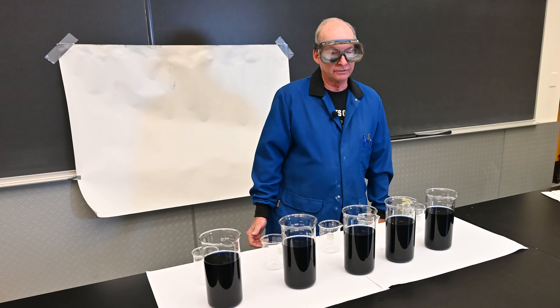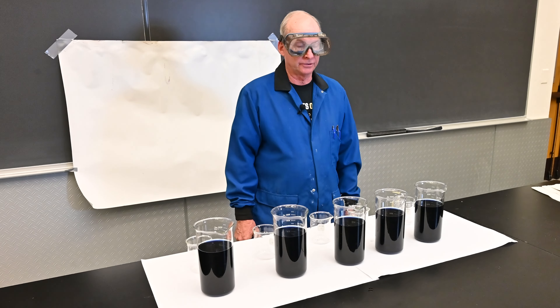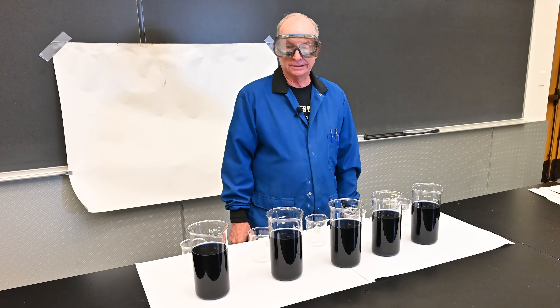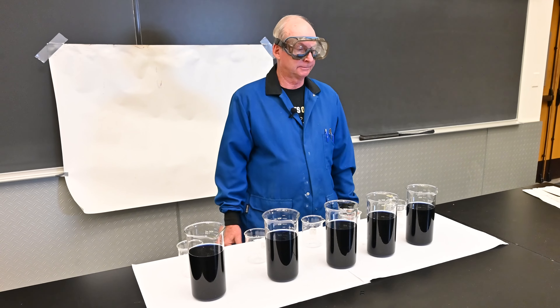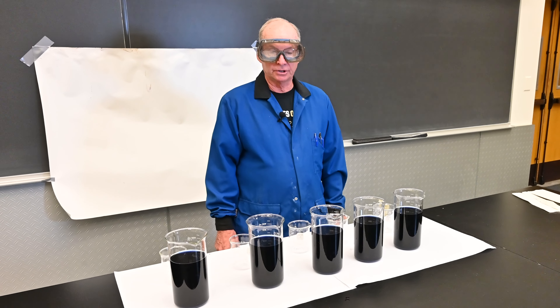Safety-wise, this doesn't use hydrogen peroxide. The iodine starch complex is sink-disposable, so a fairly nice demonstration to work with overall.